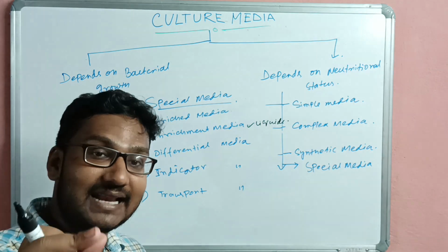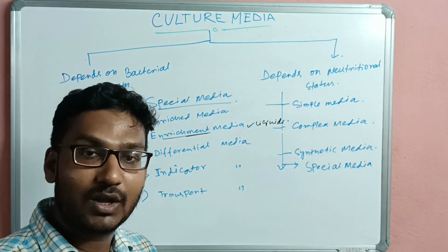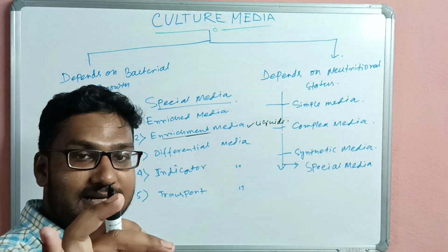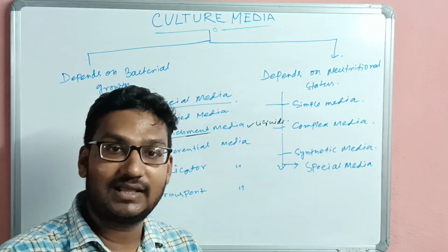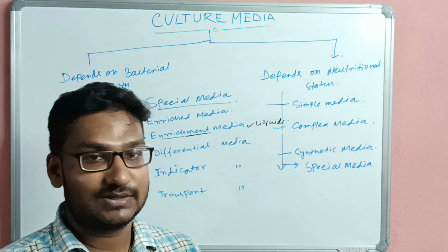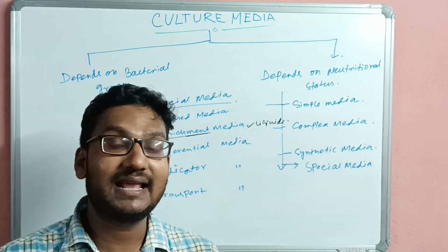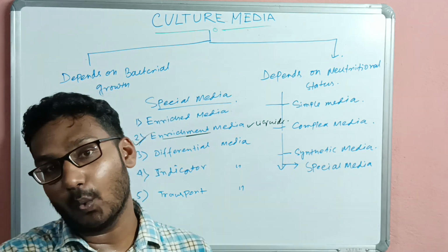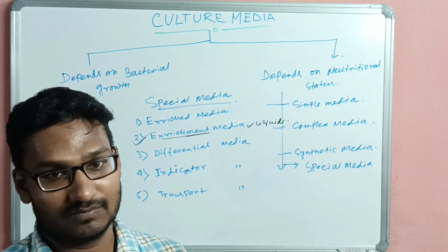One special chemical ingredient is present inside this media, which facilitates the growth of the wanted organism and inhibits the other unwanted organisms.